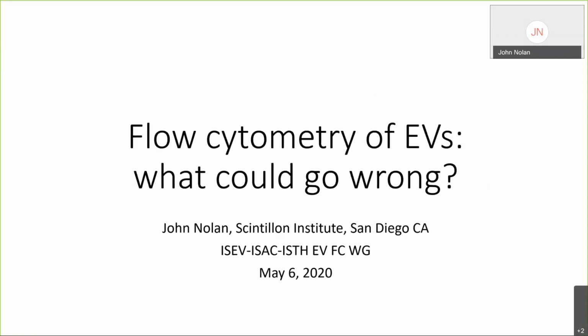There's a supplementary title, Flow Cytometry of EVs, What Could Possibly Go Wrong? And the things I'm going to tell you about today are the result of hard lessons many of us have learned trying to use flow cytometry to measure vesicles. And so this is the first of a series of educational talks on different topics. I'm going to give a broad overview here today, but we'll be having more presentations and discussions about individual topics in the future.